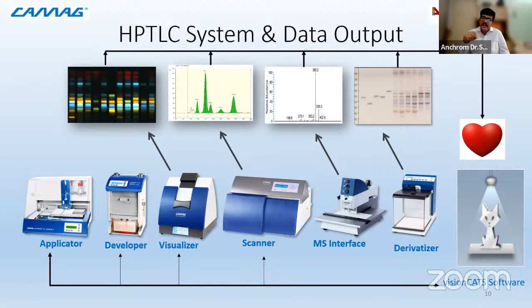So this TLC MS interface minimizes that complexity, and only the selected molecule is being injected with very, very low background noise, and selective molecules can be identified with the TLC MS interface. Now, people may think this is very simple, like you just take a plate and send it into a mass spectrometer, but it is not that.